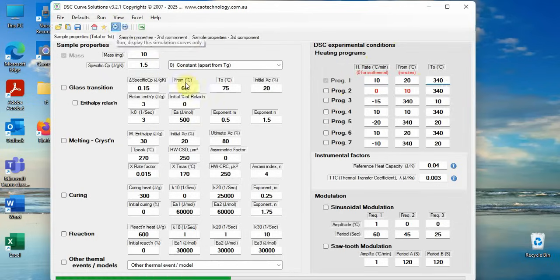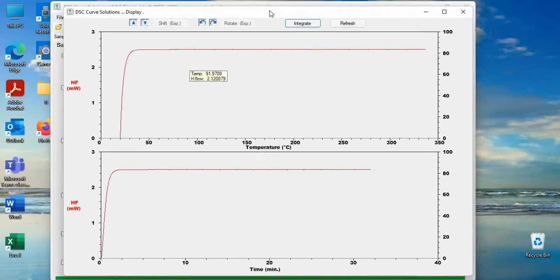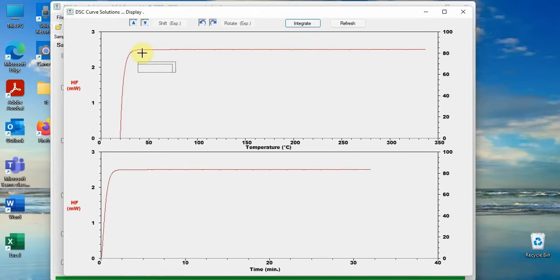The results show two DSC curves. The top one is for heat flow versus temperature, the bottom one for heat flow versus time. The curves start from zero, via a transition period of tail, settle in a constant value.